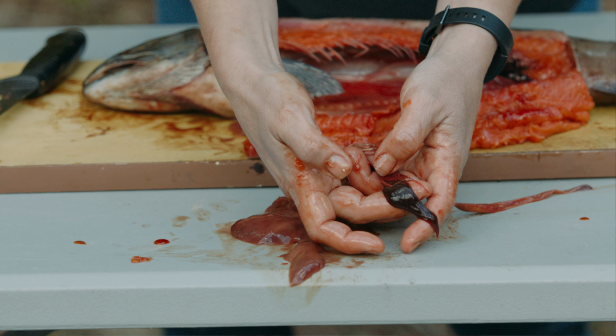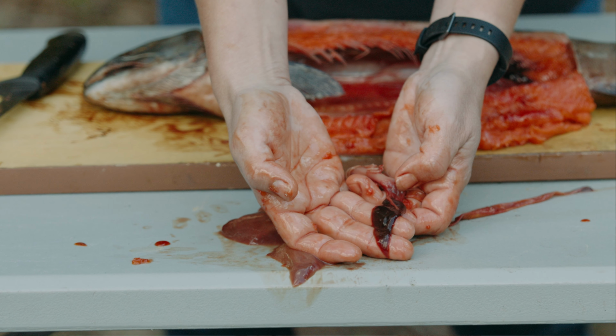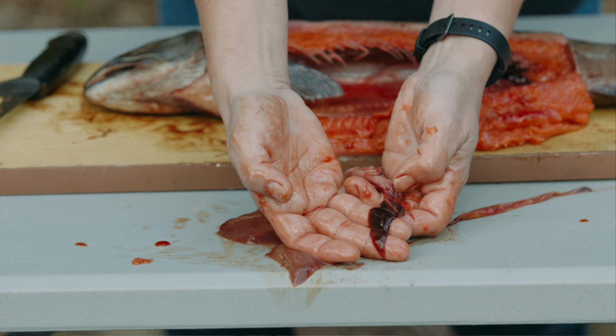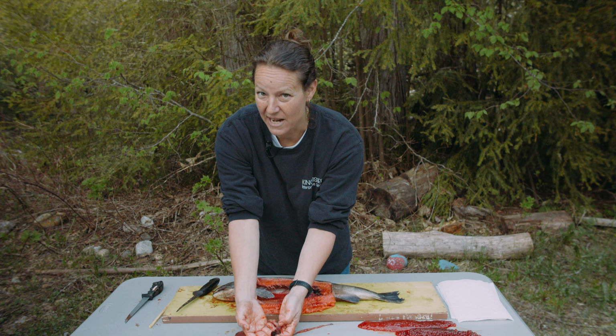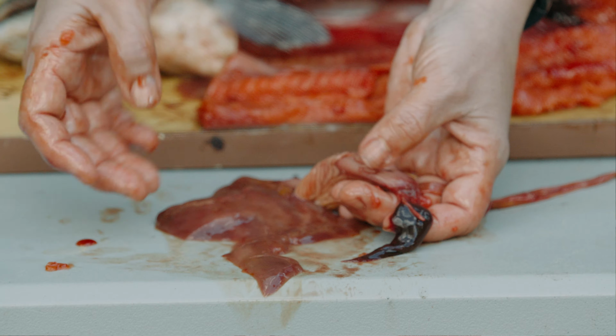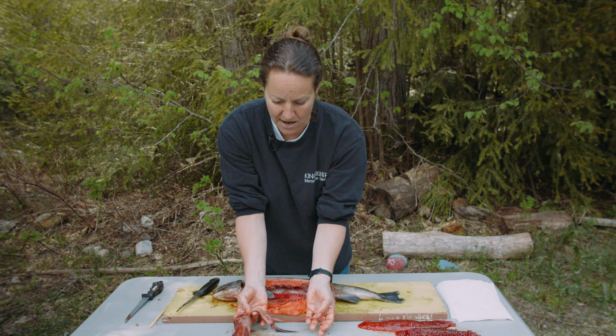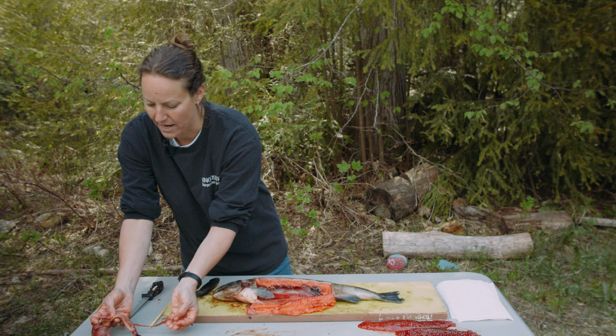And we have another organ right here. And this organ rhymes with clean. It's called the spleen. And it's actually a recycler. It helps recycle used blood. And it will store blood in case the fish needs that blood in an emergency. All right, so there's our digestive system, boys and girls. Now I'm going to put that over here to the side.